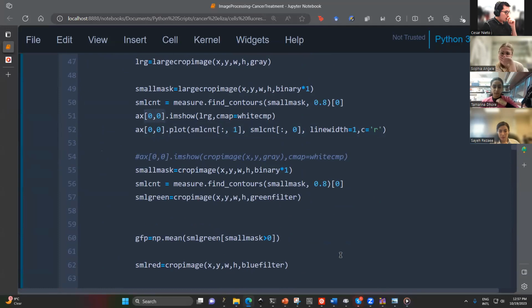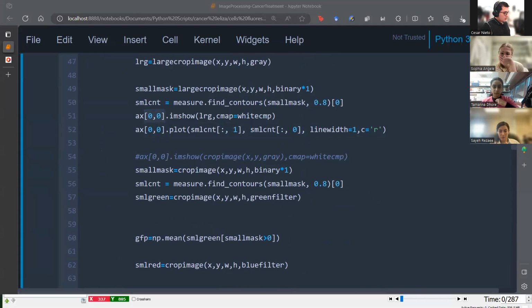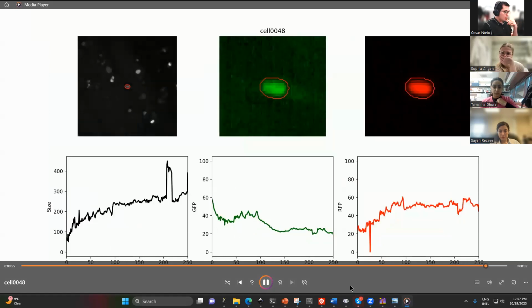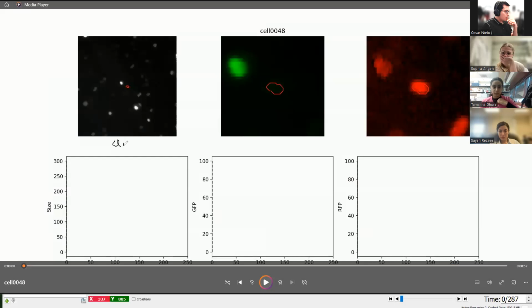What I did was, this is an array of matplotlib, so this has the coordinate AX00 for plotting. Now this is AX01. This one is AX02. This one, sorry for my handwriting. And this guy is AX10 and so on.